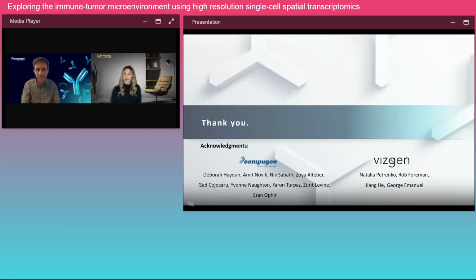Very good. And Dr. Roy, Xenium will offer a panel of 5,000 genes soon. If you would start your project now, would you still go for MERFISH? So, good question. We're currently evaluating our next steps, and actually we've looked into Xenium.